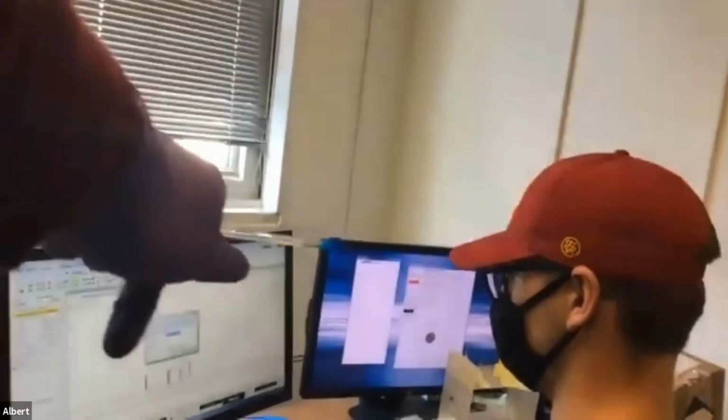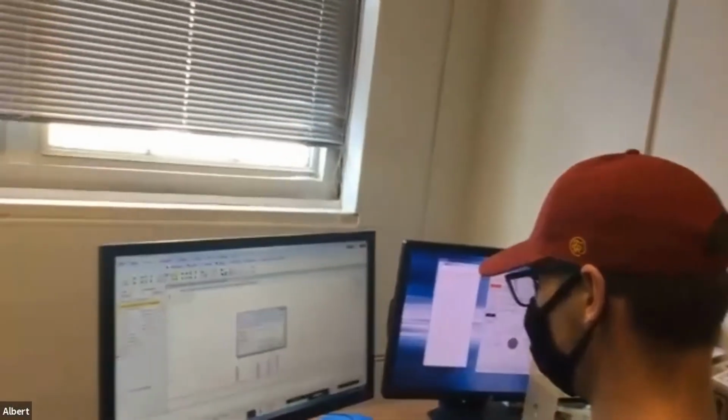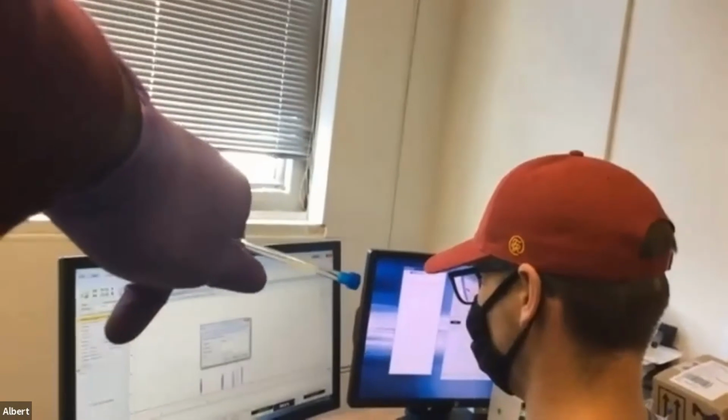And then take Russell off and just put NMR. Put in an NMR SU. No, that's fine. Take all that off. Take the slash off too. We'll just save it in the main folder. And then just click OK. We'll be able to find it.